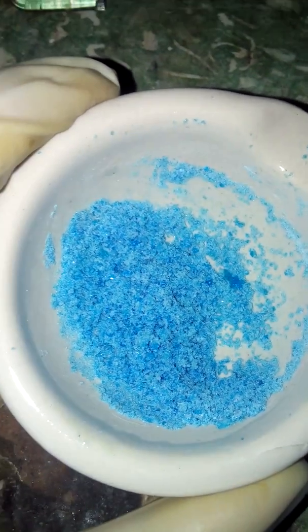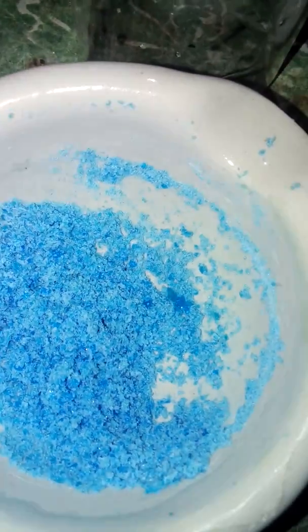Here is our crushed copper sulfate. You don't need to clean the mortar and pestle. Safety gloves are on. Now we'll transfer this to the beaker — I've transferred the copper sulfate into the beaker.